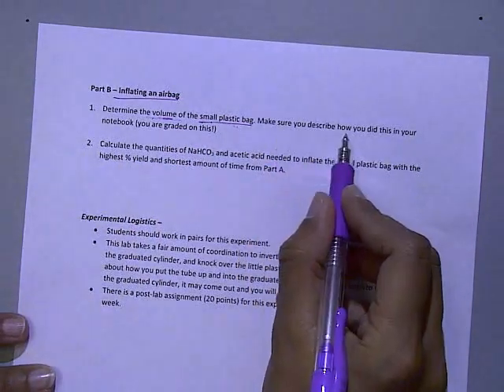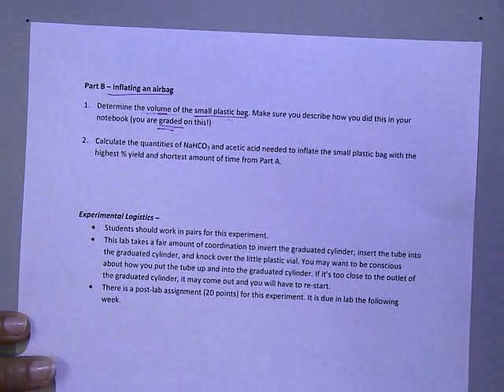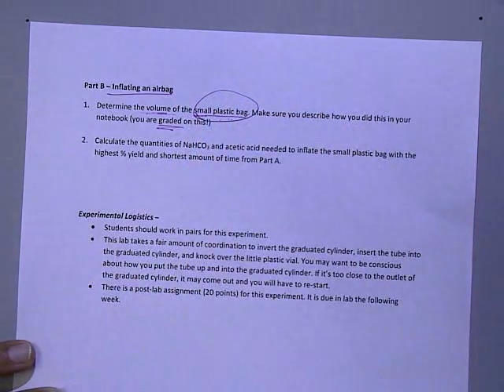I want you to describe how you actually did this, okay? You're actually graded on how you do this. Be creative. Be creative how you're going to figure out the volume of this plastic bag.